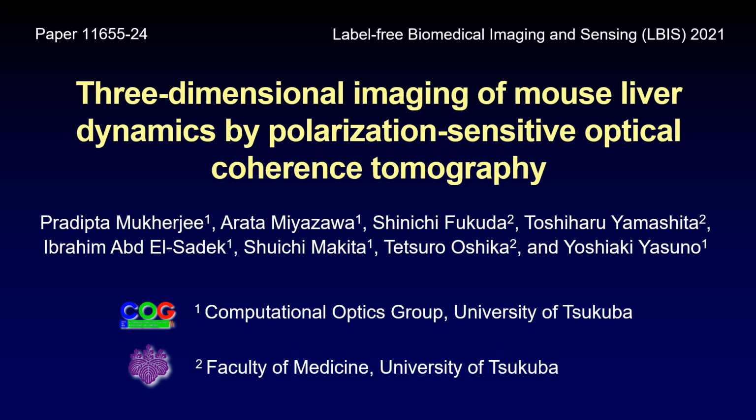Today I am going to talk about three-dimensional imaging of mouse liver dynamics using polarization-sensitive optical coherence tomography, and I am Pradipta from the Computational Optics Group at the University of Tsukuba.